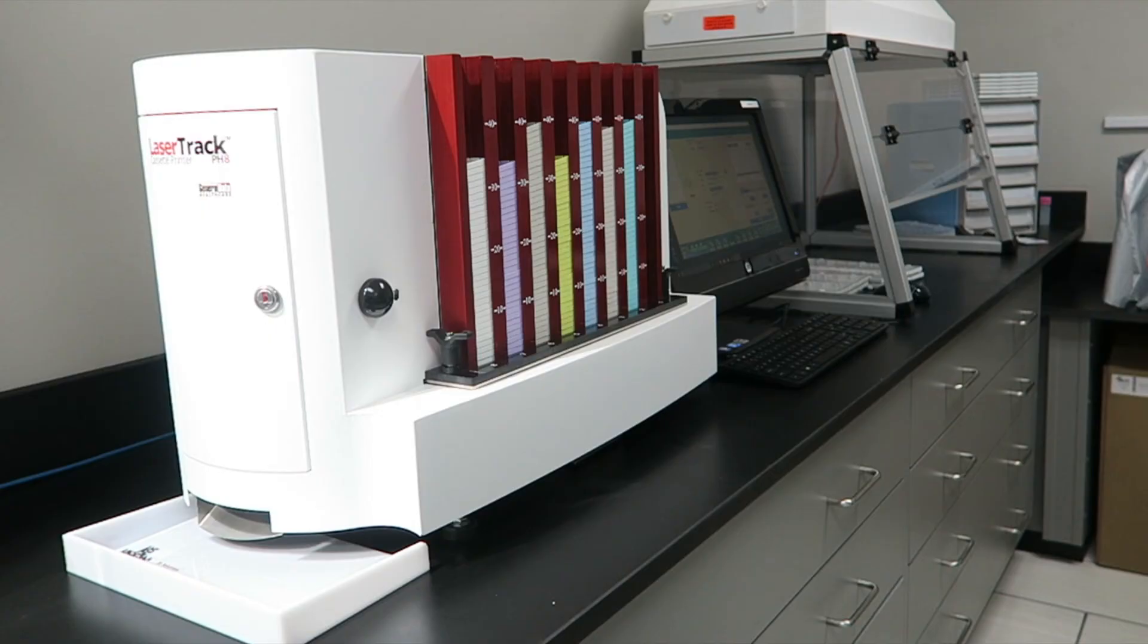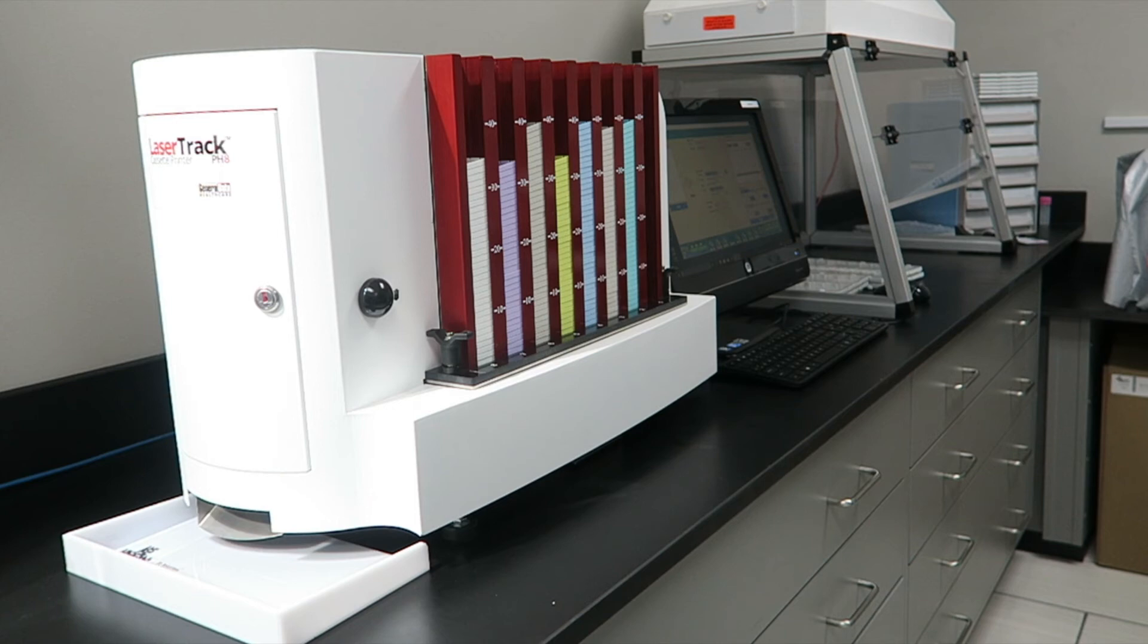The LaserTrack PH-8 cassette printer's reliability, print speed, cassette handling, and barcode printing expertise make it a great choice for today's labs with high volume cassette printing needs and for those who want to use barcode technology to track tissue specimens.